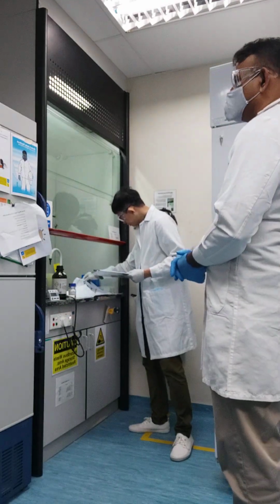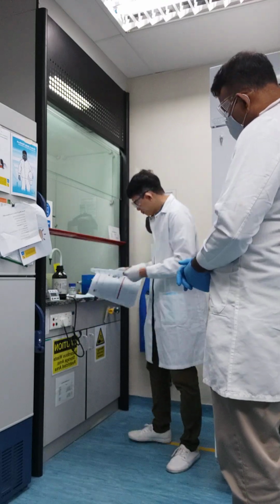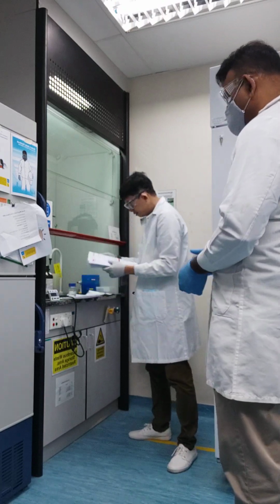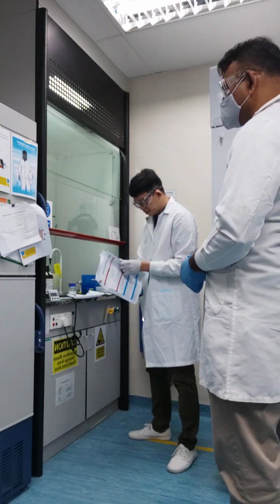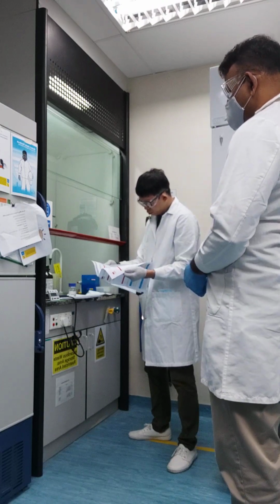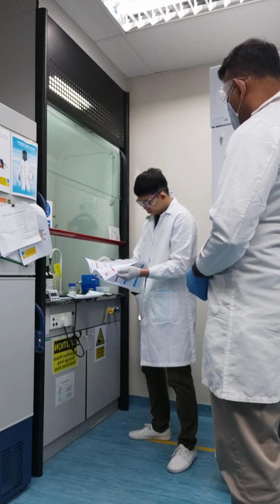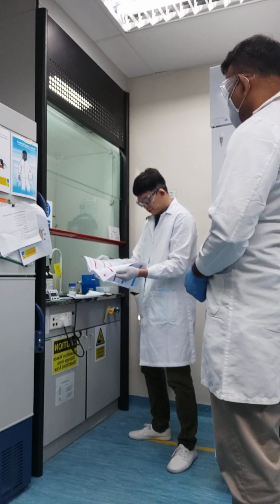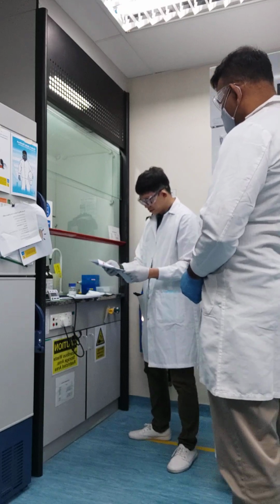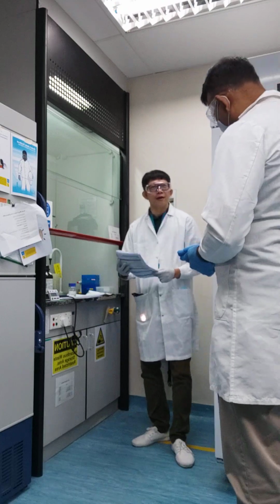I need to go to the safety data sheet here. I need to refer, like you mentioned to me, to sections. Let me take a look. Section 2 talks about hazard. Section 3, section 4 talks about first aid, firefighting, and section 7 talks about handling. Section 8 talks about PPE. Am I correct? Excellent.